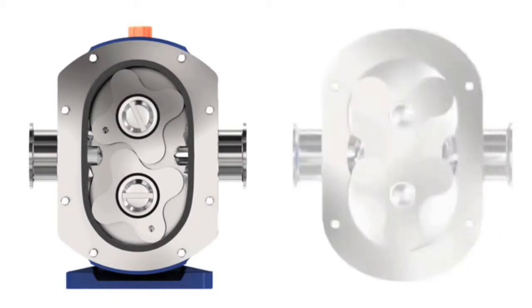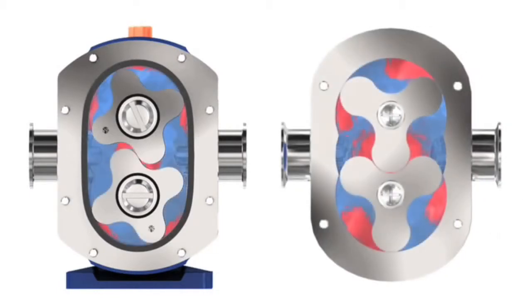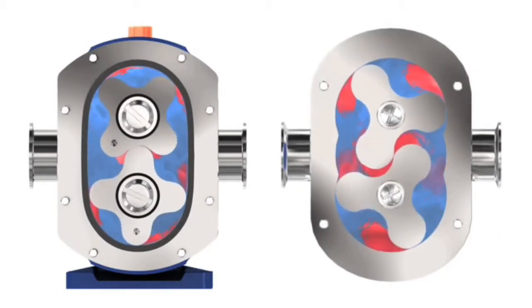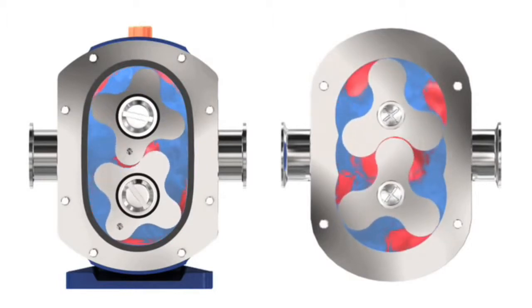Our pumps are not just hygienic, they are also gentle. Our low shear designs ensure that your precious product is preserved just as it should be. To ensure exceptional product handling of shear sensitive liquids, the SX incorporates close clearances to minimize product slip.